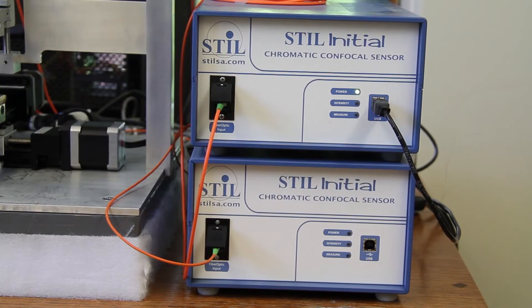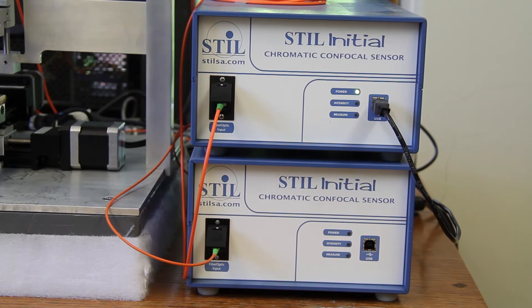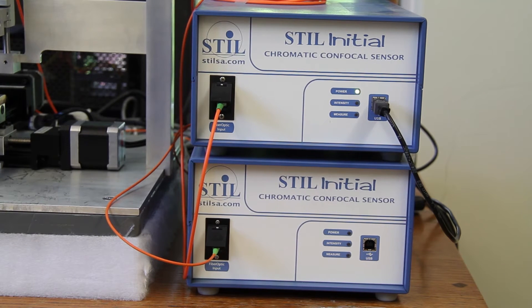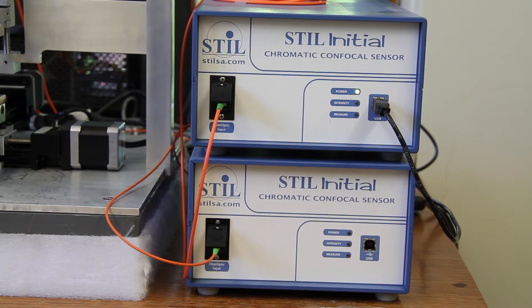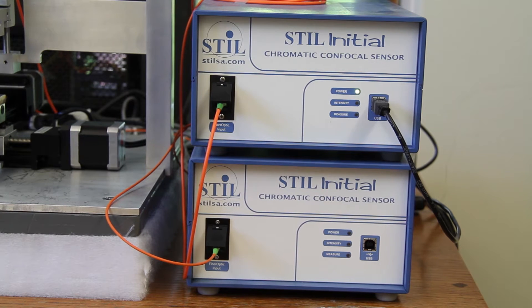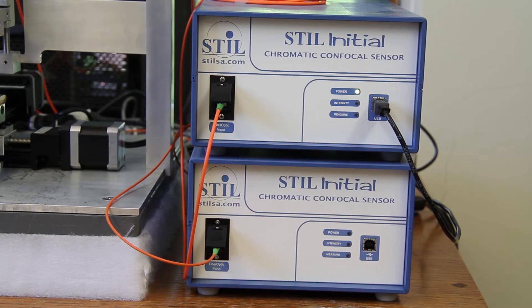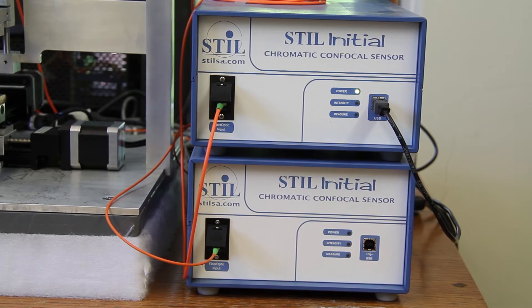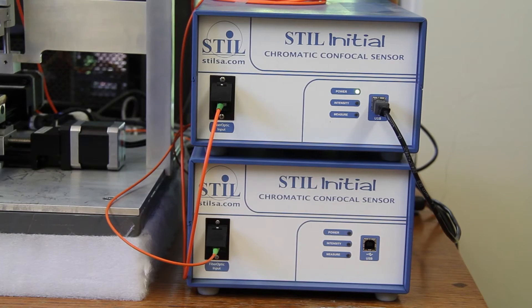During dark signal acquisition test, the intensity and measure LED indicators on the front panel blink on and off in green alternatively to indicate the operation is in progress. When the measurement is done, the intensity and measure LED indicators blink on and off simultaneously.